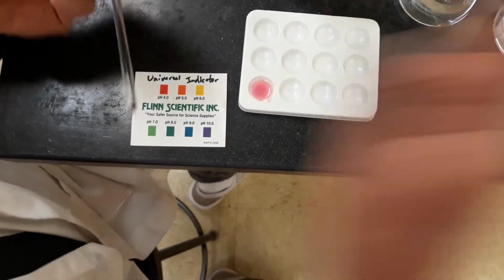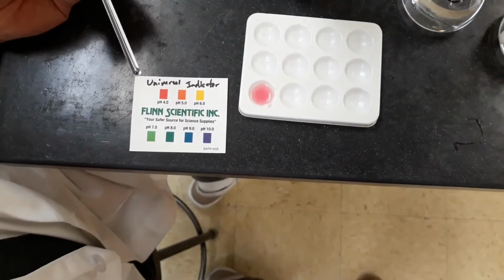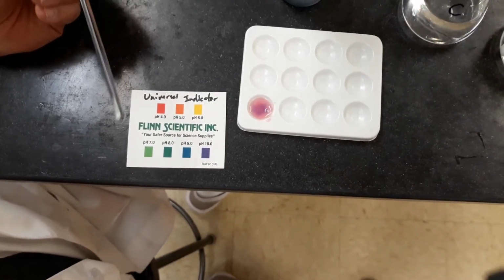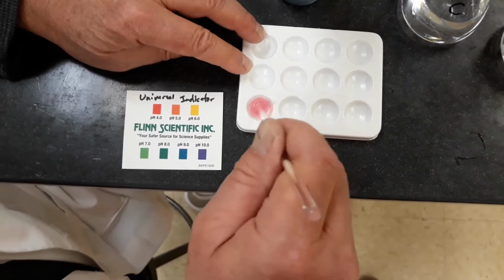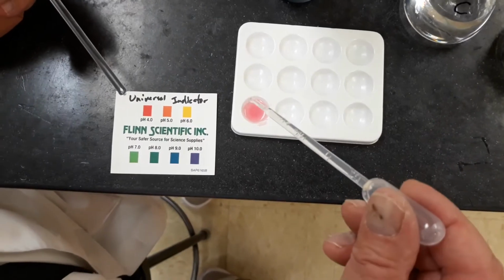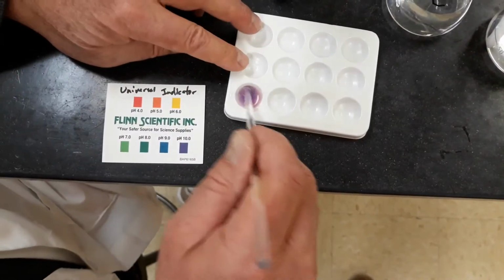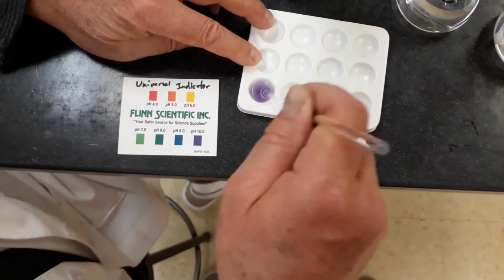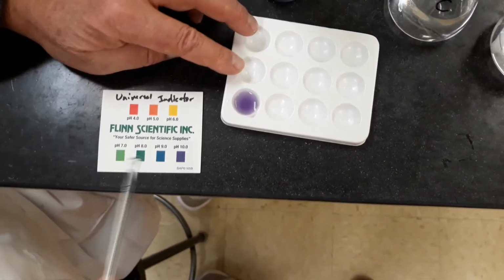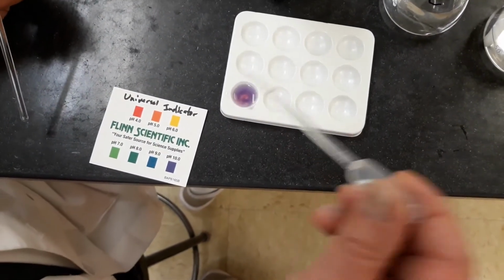Fourth drop. Fifth drop. 6th drop. Seventh drop. Oh, I think I went one too far. You notice there was a half drop, and so I think if I had one less drop, we'd be right about there. Let's try just a tiny drop of C.